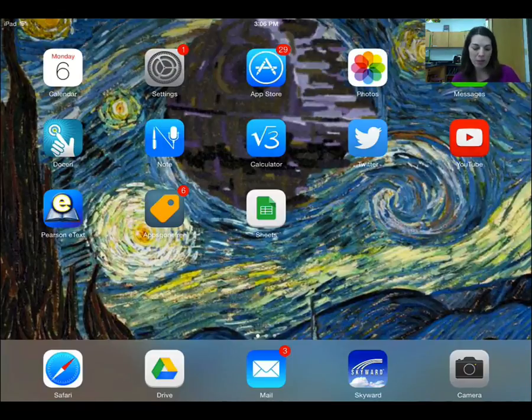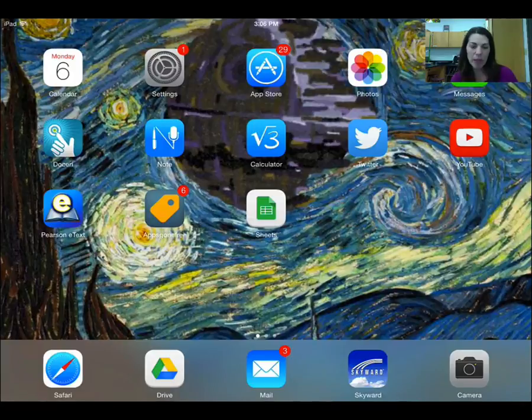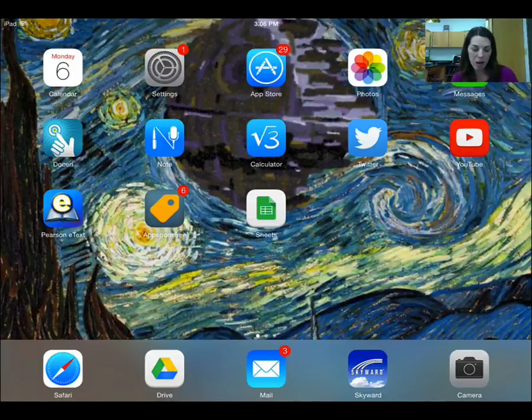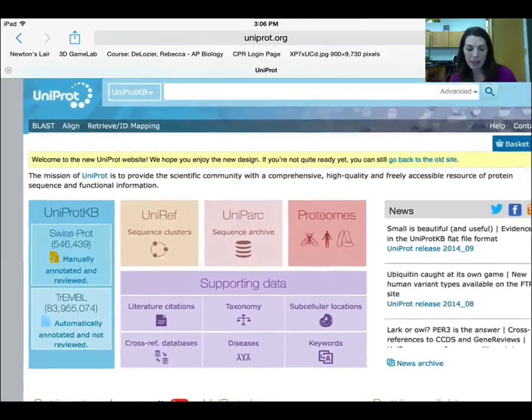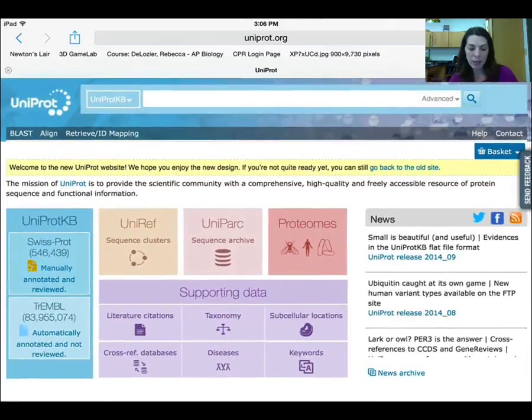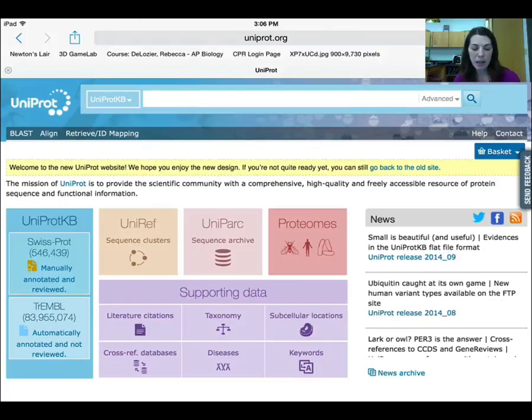The first thing you're going to want to do is open up the UniProt website. It's uniprot.org, or you can get there from the link on the Bionerdery. You're going to want to search for your gene of interest in the search bar at the top.